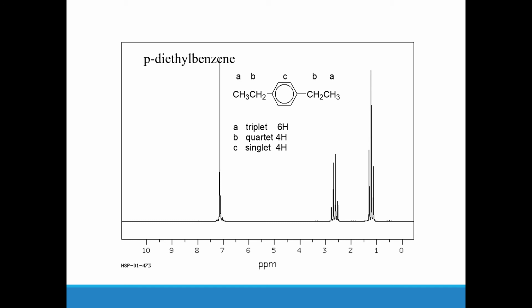So what about p-diethyl benzene? p-diethyl benzene has three signals. As you can see, it is symmetrical. So A, B, B, and then whatever is left is the C. Again, easy peasy. The C should be this ring, right here at 7. Meanwhile, A should be the one at the periphery because it's the furthest away. So I'm assuming it's this one. Let me make sure. Hydrogen is 2, plus 1 is 3, triplet, 1, 2, 3.